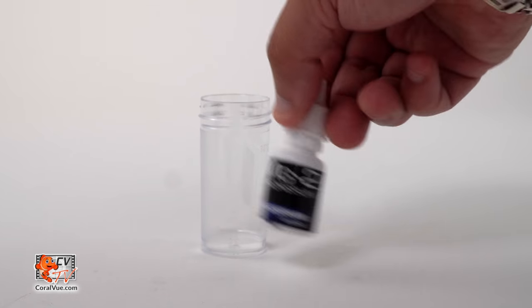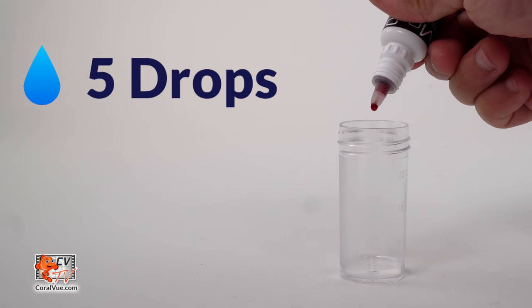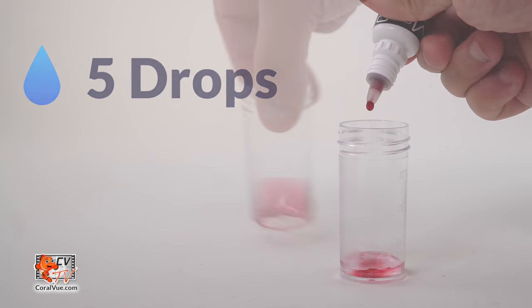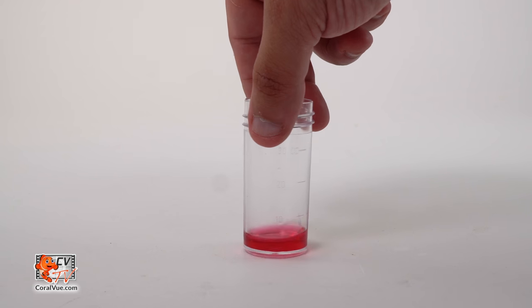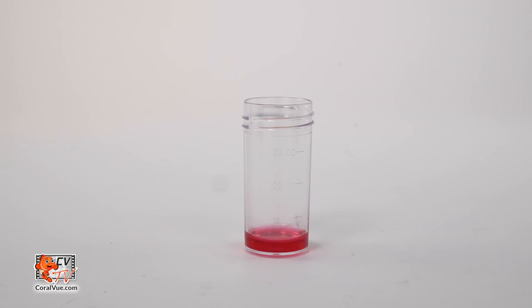Carefully shake the MG2 reagent bottle before use, then add 5 drops to the test vial and swirl for 20 seconds. The sample should become a dark red purple color.